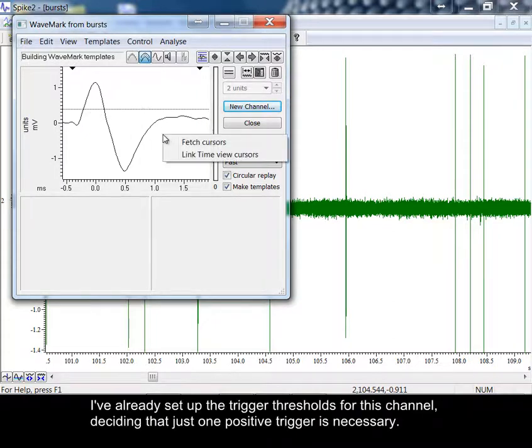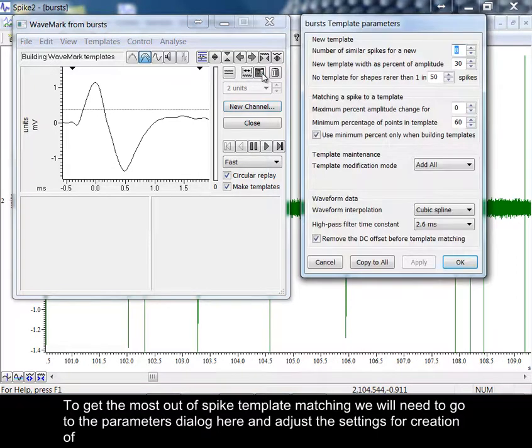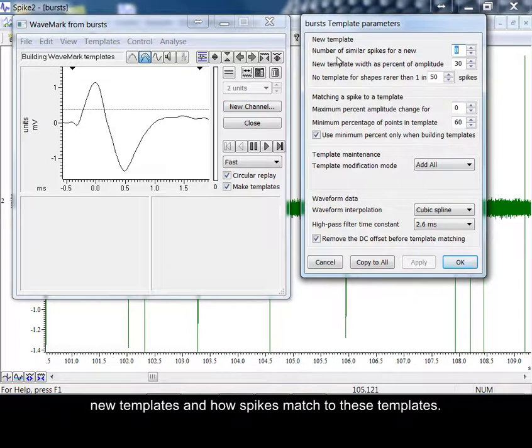I've already set up the trigger thresholds for this channel, deciding that just one positive trigger is necessary. To get the most out of spike template matching, we will need to go to the parameters dialog here and adjust the settings for creation of new templates and how spikes match to these templates.